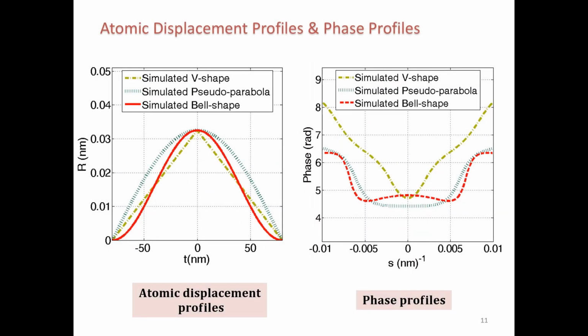The introduced wave solution is used to simulate the phase profiles for 3 typical atomic displacements. You can see the atomic displacement profiles on the left and their corresponding phase profiles on the right. Now, let me compare these simulations with the experimental results.